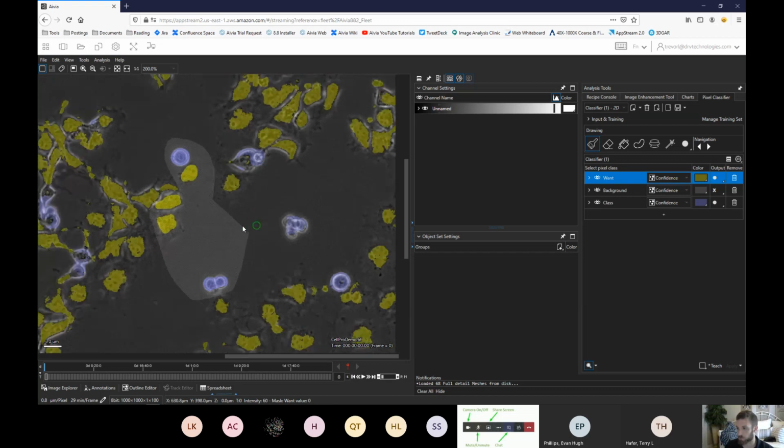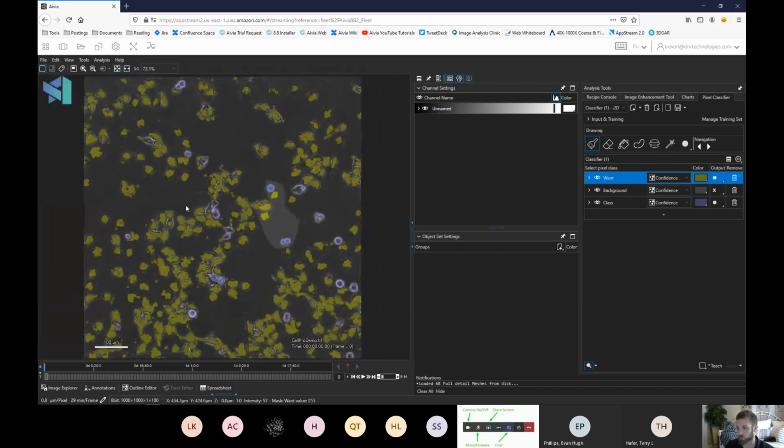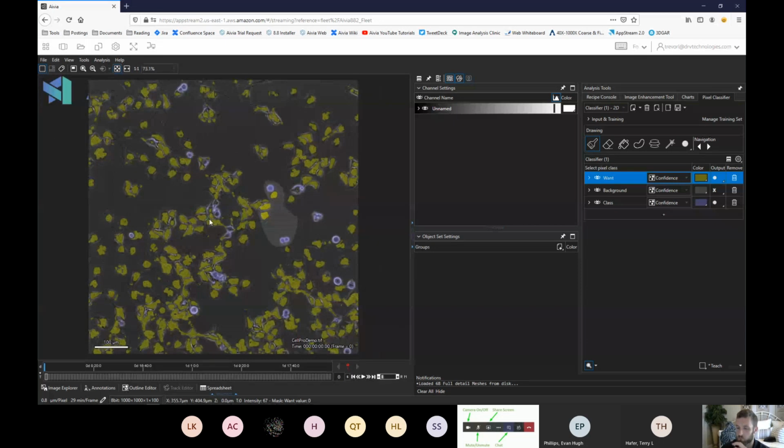Okay, and with the preview on, this is what it will give me. Okay, I think that makes sense. So it still is kind of treating it as another want class, or it's sort of keeping it separate from what the other thing is that you might want. I think it makes sense. Okay, right. Thanks. That's correct.